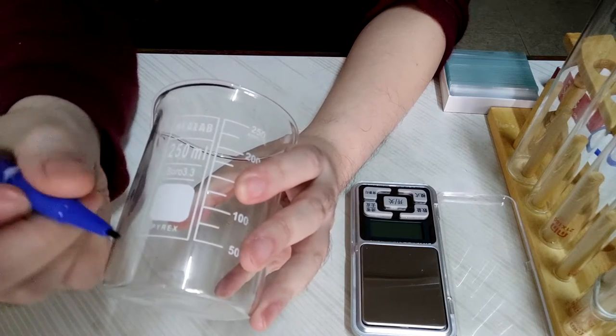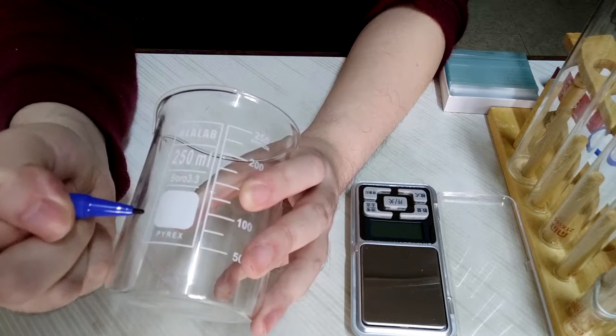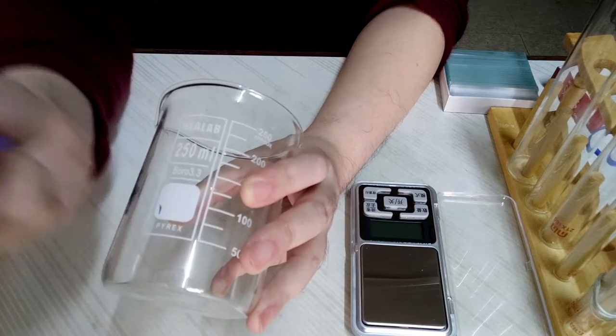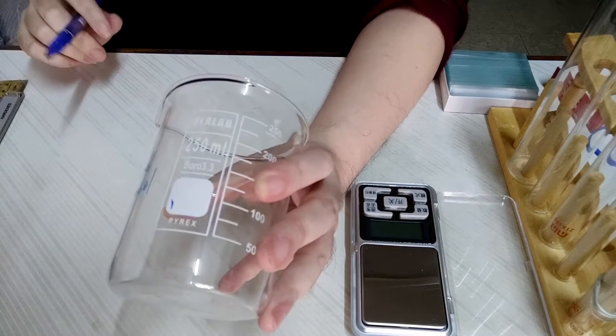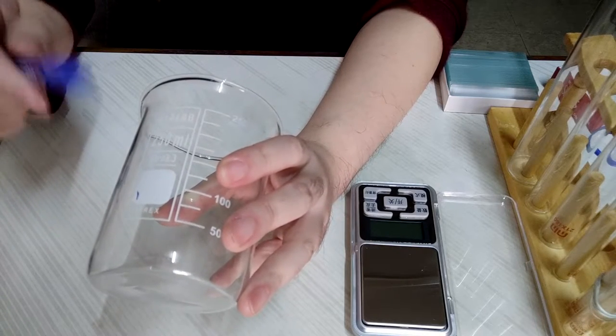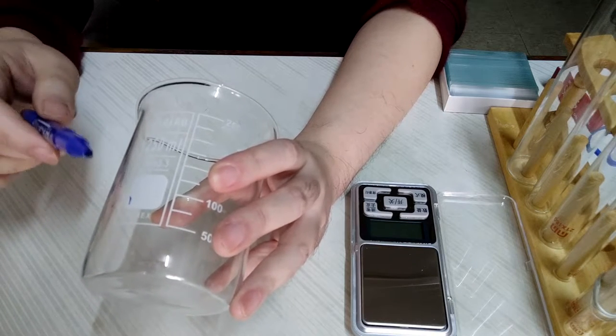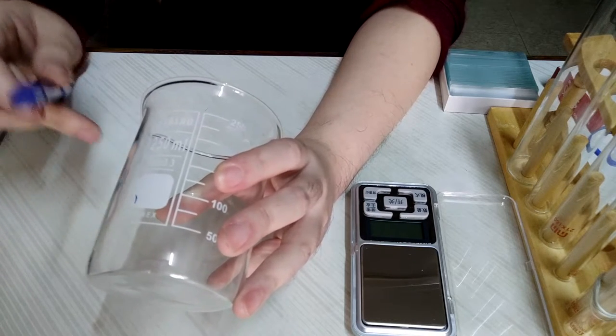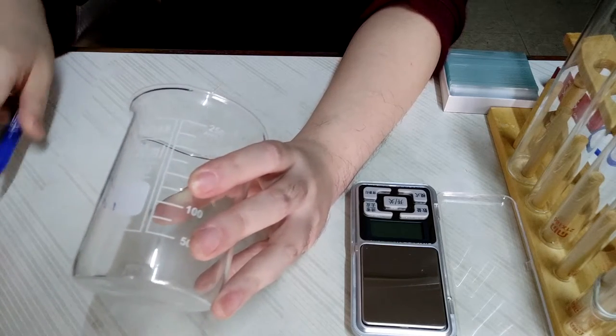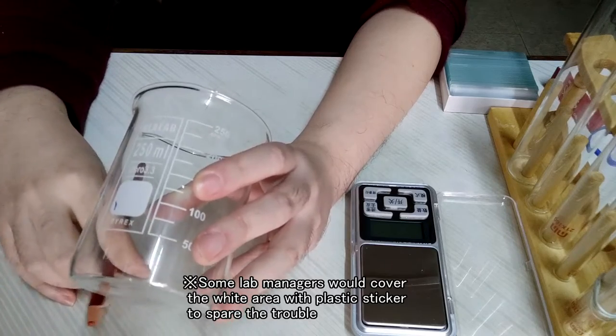If you write something on the white area with ball pen or marker, it will be quite difficult to remove after. And if you leave the marker for a few days, it will be nearly impossible to remove completely. So what is the white mark for? Actually, it is for pencil or something called grease pencil.